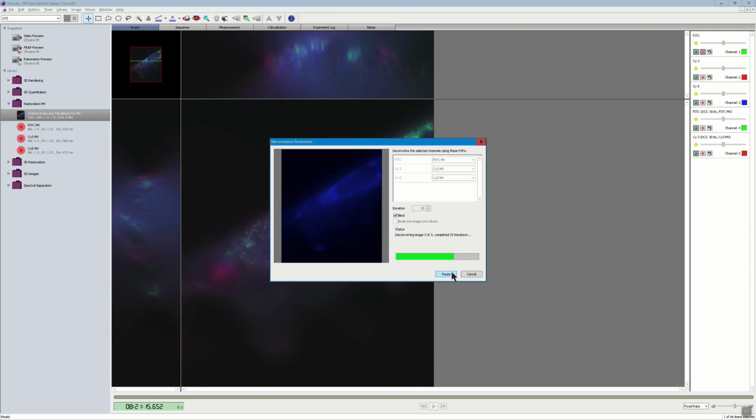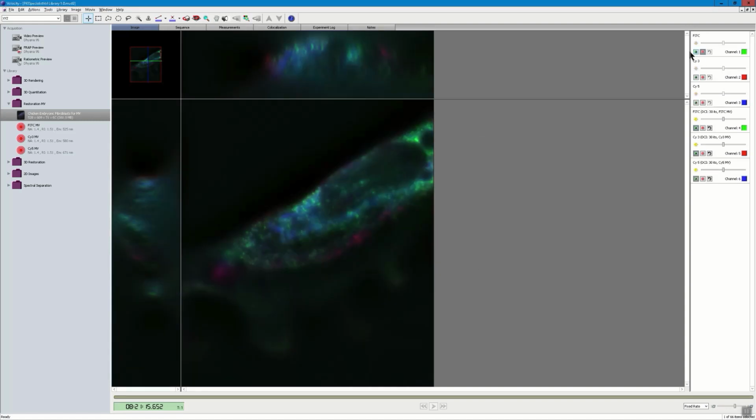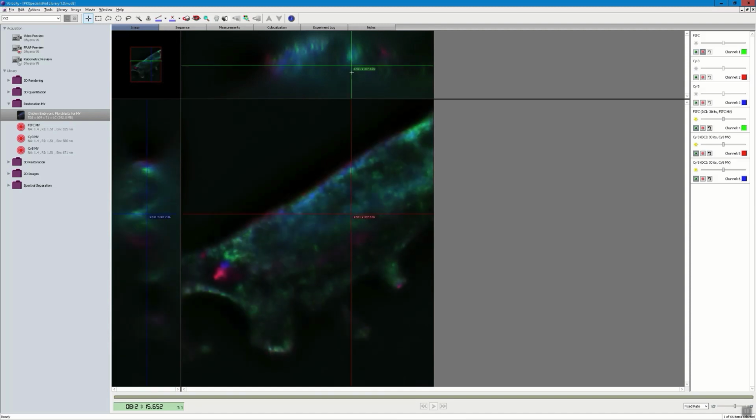This example running at actual speed shows the deconvolution of an image that is 528 by 608 pixels with 71 slices. Deconvolution is often critical in situations involving the analysis of tightly clustered objects where automatic detection would otherwise prove difficult.